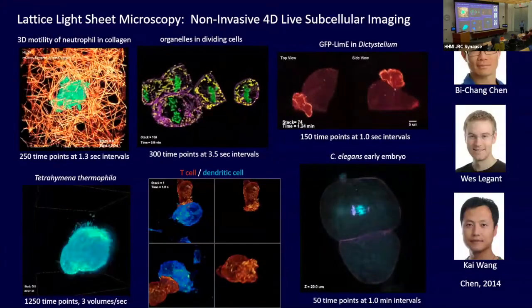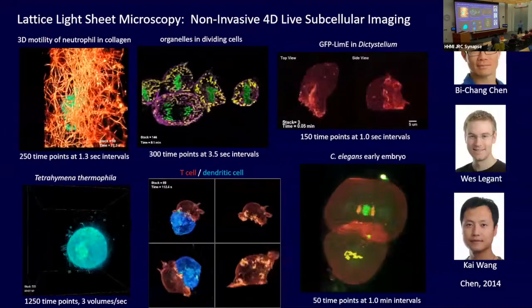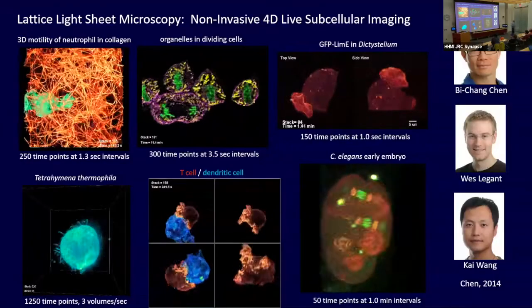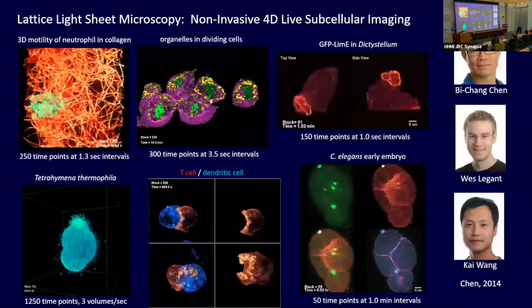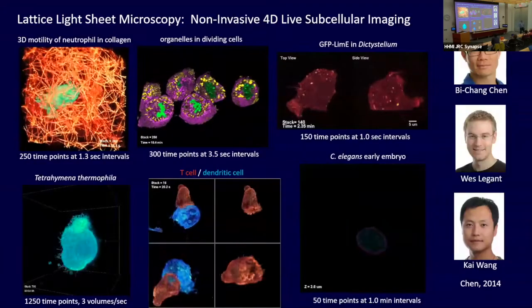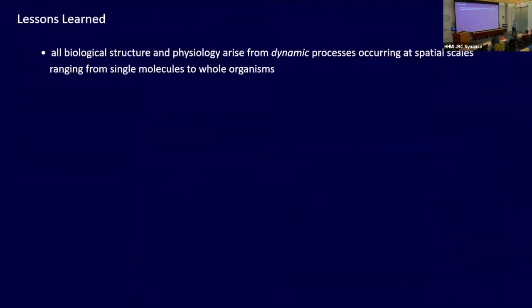And my major frustration is that this microscope has not garnered more attention by more people. People still seem to have in their head this idea that the metric that matters for a microscope is its resolution. Resolution is one metric for a microscope, but speed, non-invasiveness, all these other things are equally important for discovery. And this tool really excels at that.